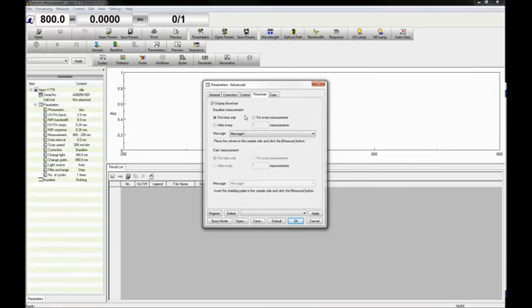If the dark measurement option has been selected in the correction tab, the timing of the dark measurement must be specified as well, along with any desired message.